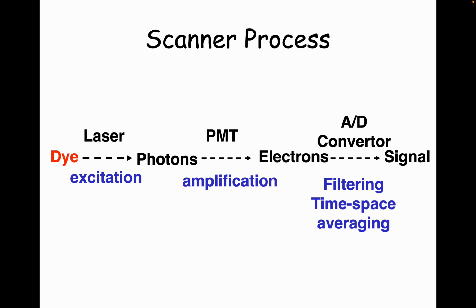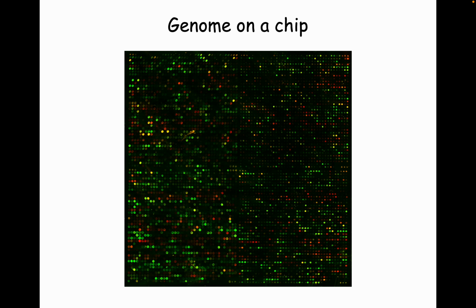It's like a little Excel sheet where there's a value in each of the little boxes. And that is the brightness or color or whatever of the image. Yeah, and you can have a couple values in there or make a couple maps. And then you can convert that and you'll get a signal. There you go. So here's an entire genome SNP mapping array.